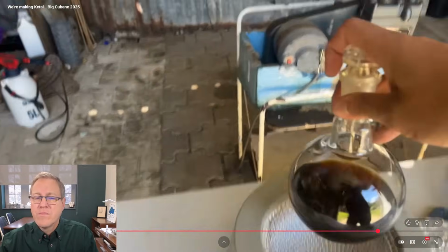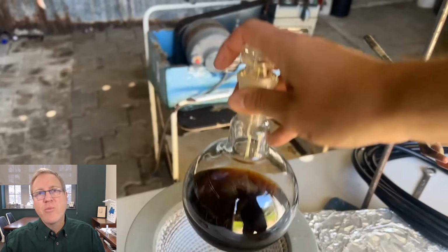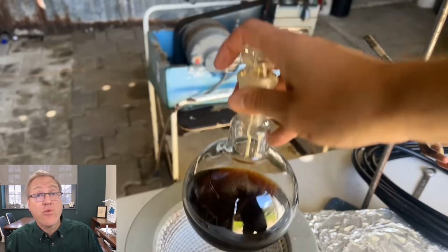There's not as much as I would have liked. We're trying to do this on the largest scale we possibly can. Now remember, by my math, he would expect 289 grams of product. And if that's a 1 liter flask, I think he has every bit of 289 grams. Maybe there's a little bit of ethylene glycol in there still. Maybe there's a little toluene. But I think that looks like that's a lot of material. I think he's in good shape by my eye.